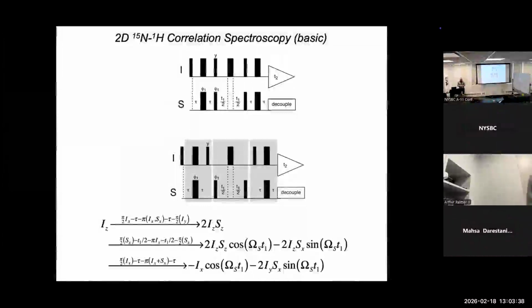So today I want to just say a few things about HSQC experiments, but then start talking about relaxation for the rest of the week. And then next week, Ann will introduce tensors. So the COSY is the start of 2D NMR and the most basic 2D NMR experiment for homonuclear systems. And either the HSQC or the HMQC are the basic 2D experiment for heteronuclear NMR.